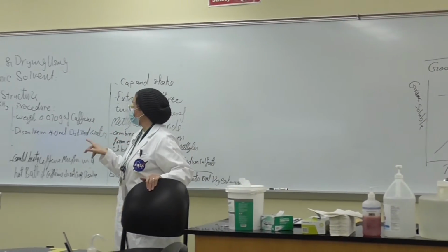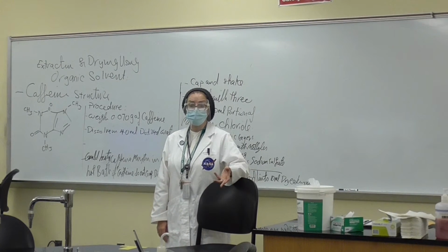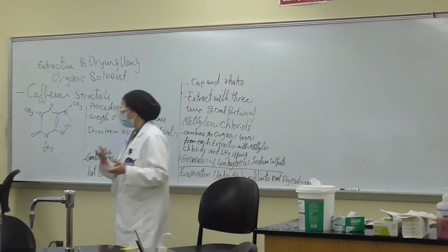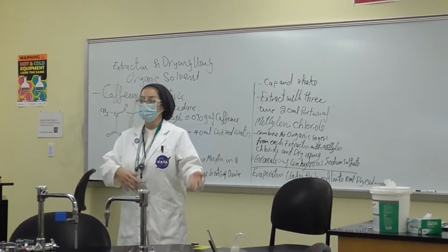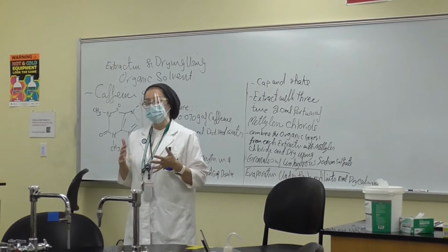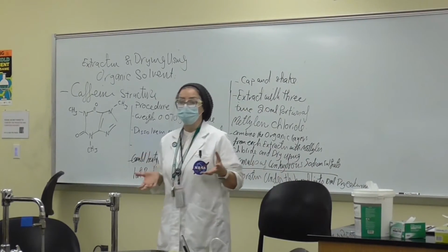This is a very important technique that we are using for chemicals: how to dissolve them in the proper solvent and then extract them from the organic layer and also the water layer. The aqueous layer is usually the water.